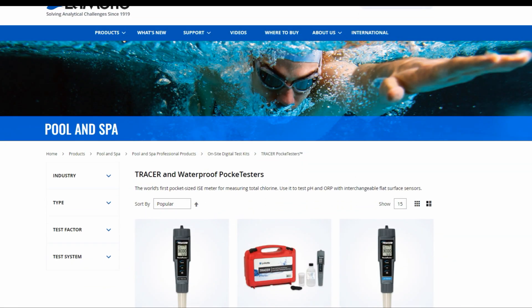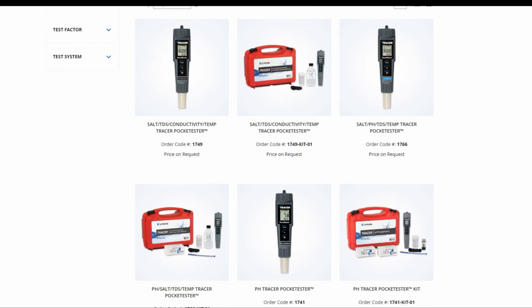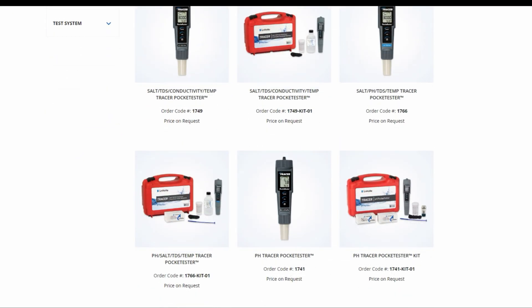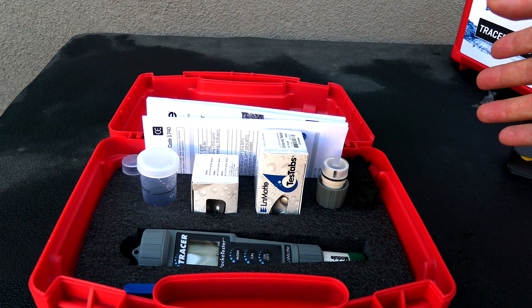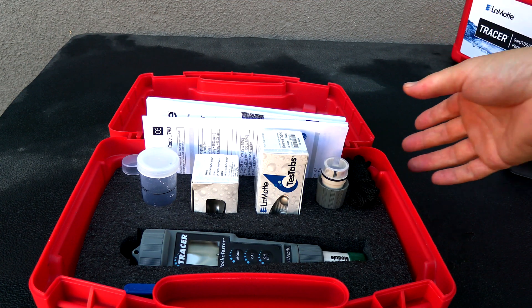There are a variety of other Tracer Pocket Tester kits available. You can go to their website to learn more about the different kits you can purchase. This is a great way to get the PH as well as the chlorine reading at your service accounts.